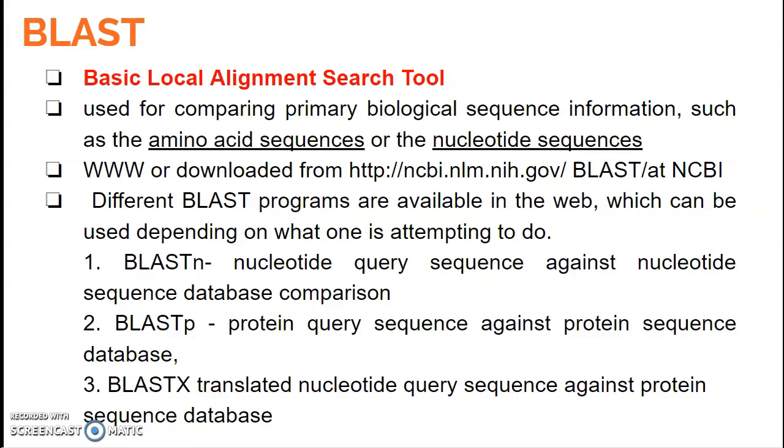As I said, we can simply search through the web interface, or it can be downloaded from the NCBI portal, ncbi.nlm.nih.gov/blast.